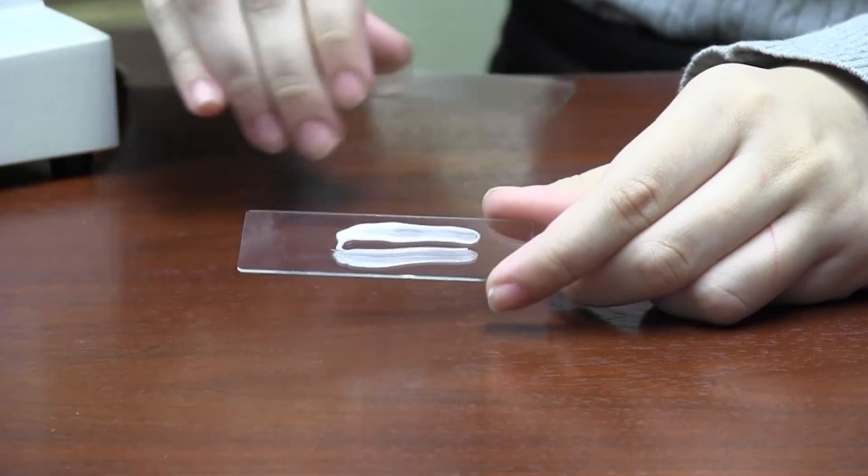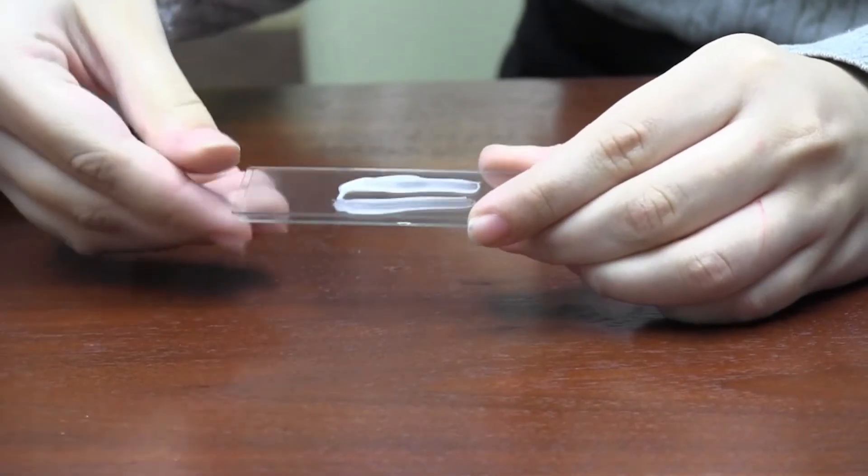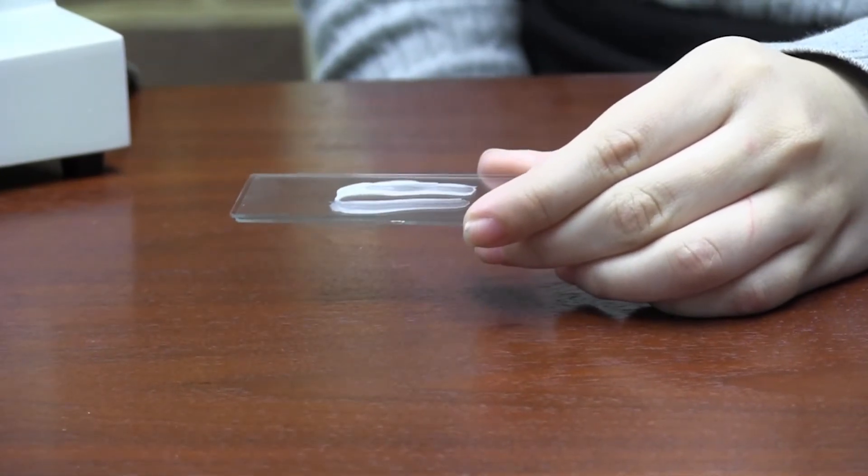When you are finished, place a cover slip or second slide over the area of the slide you touched with the swab. Handle this by the edges to avoid fingerprints here as well.